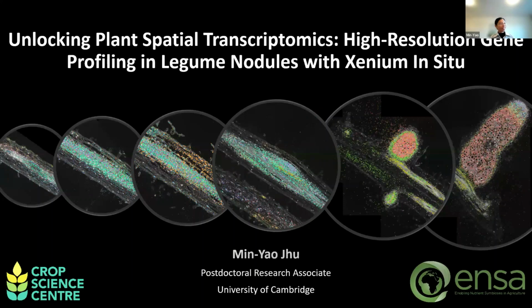She's going to share with us Xenium in situ and its application in Medicago FFPE samples, and how to use that to study nodule organogenesis. Hello, everyone. Today, I'm very excited to share our experience using Xenium in situ and how it helps us understand legume nodule development.